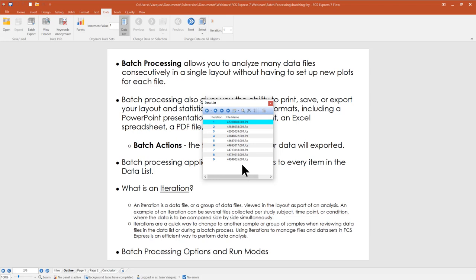FCS Express processes this information using a concept called the iteration, which we cover in more detail in our Managing Data in FCS Express 7 webinar — available on our website and YouTube channel. Briefly, an iteration can be a single data file or a group of data files that is viewed in your layout as part of the analysis.